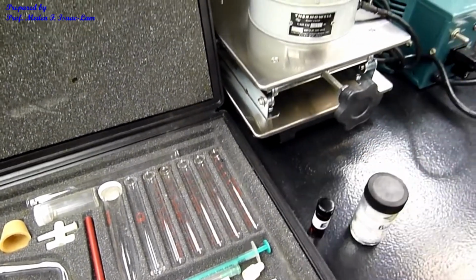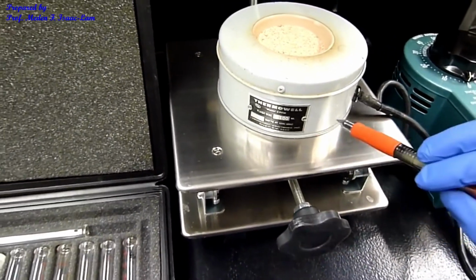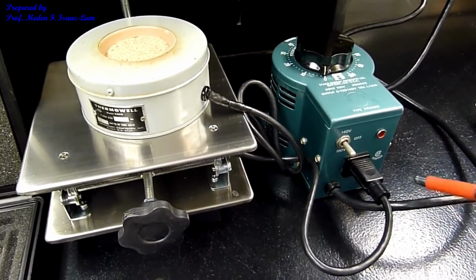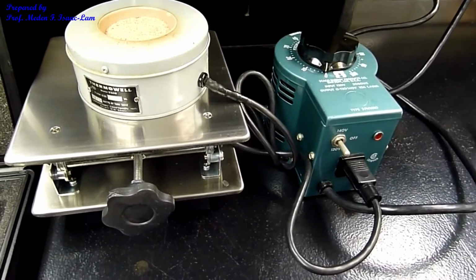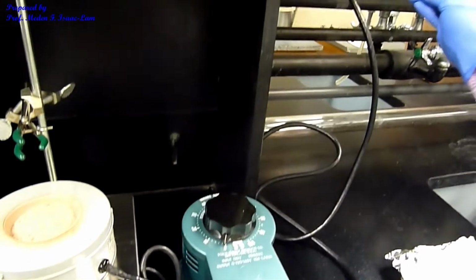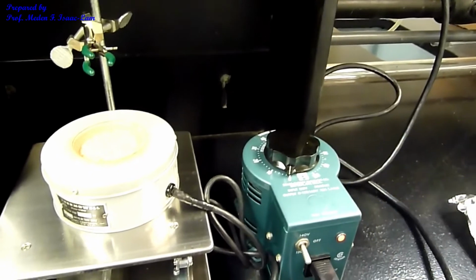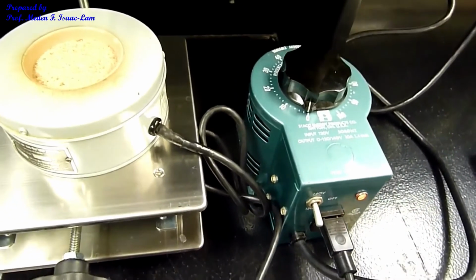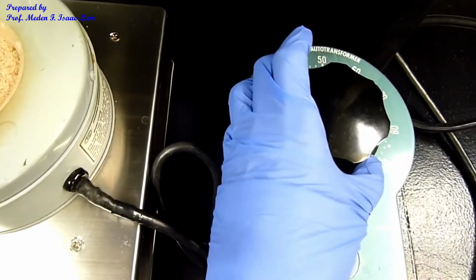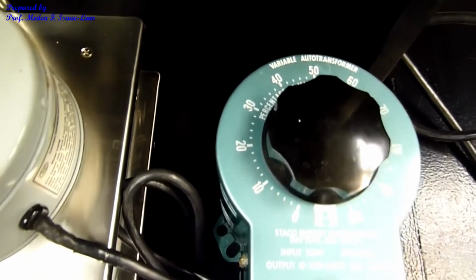And this is now the setup. We are going to boil the liquid in a thermowell with a sand bath. The sand bath is attached to a transformer, and we're going to set it to 120 volts, and then that's attached to the power outlet in here. And then I'm going to set it to about 50. So 50 at the back, set up to 50 in here, for now, because we don't really know the boiling point of the liquid.